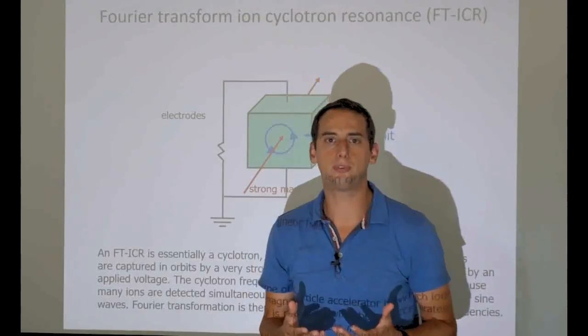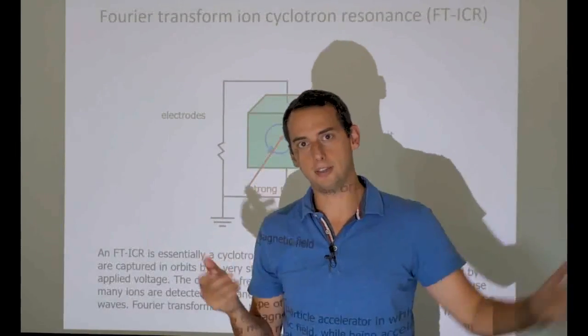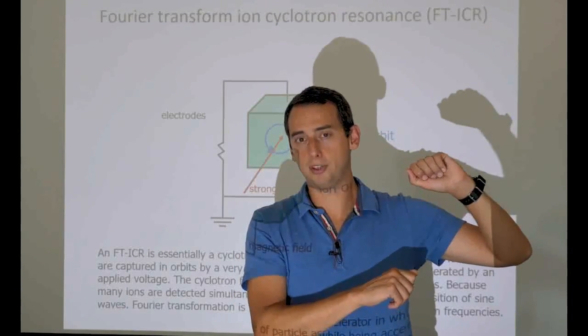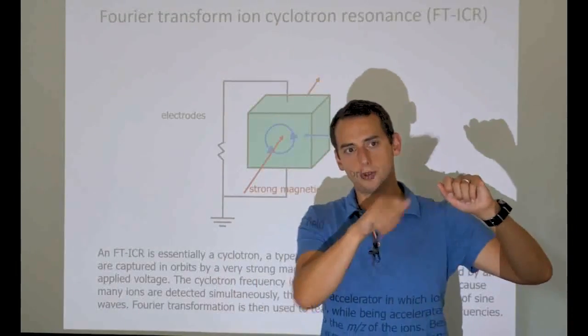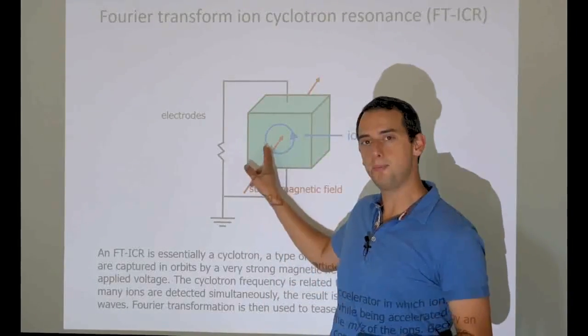Now, for practical purposes, you tend to occasionally throw out, it's like an ion trap, this cyclotron. So occasionally you have to throw out the ions and let new ions come in because they tend to come off a liquid chromatography gradient, as we've seen in the second lecture when we talked about the electrospray source. And so you have to occasionally recycle them and throw them out and get new ions in. But you can keep this going for a while.